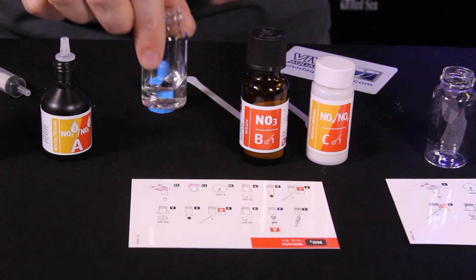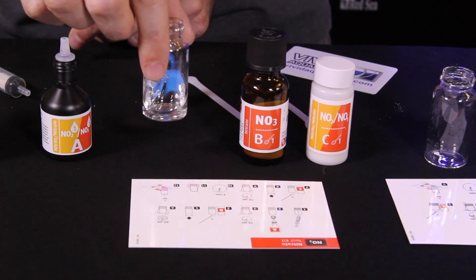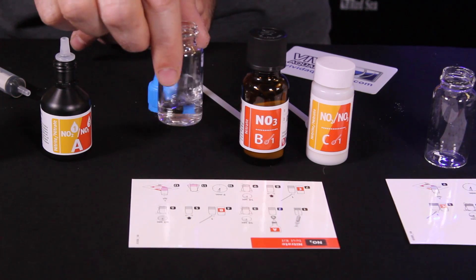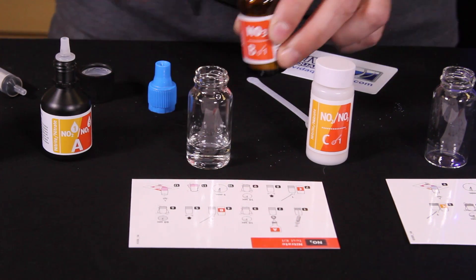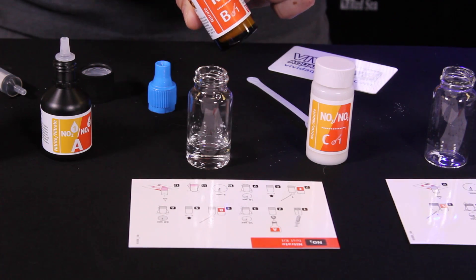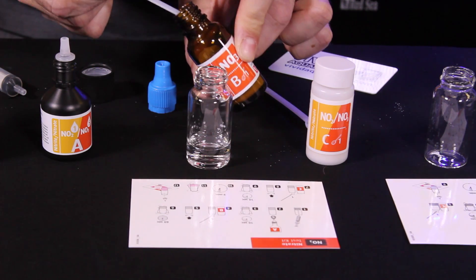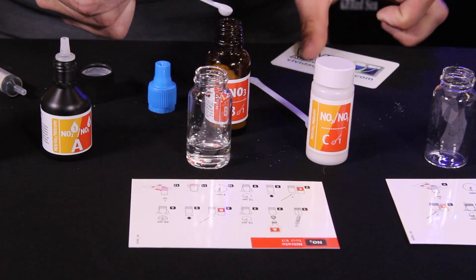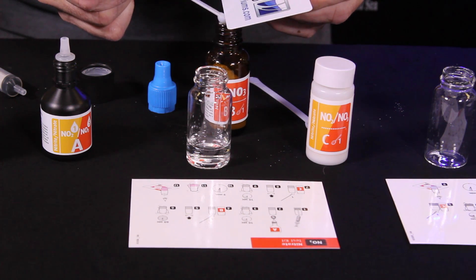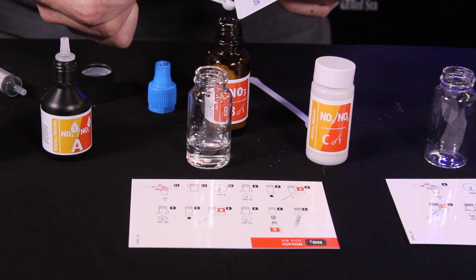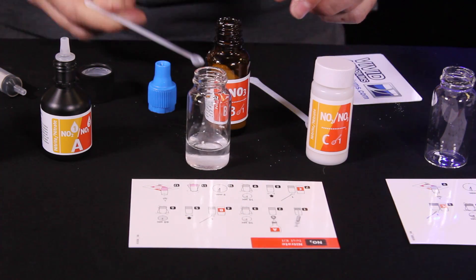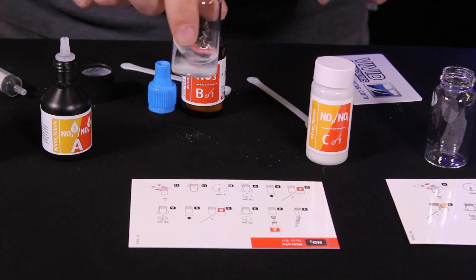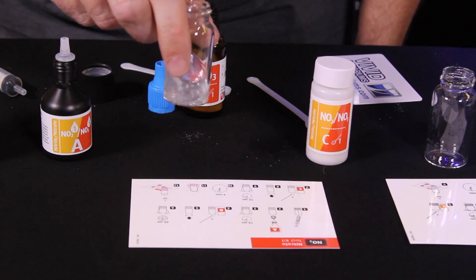Now per the instructions we're going to swirl that for 10 seconds. And now we need to do a level scoop of reagent B. Again, I'm going to use my card to kind of level that off and make sure that I am getting a level scoop.